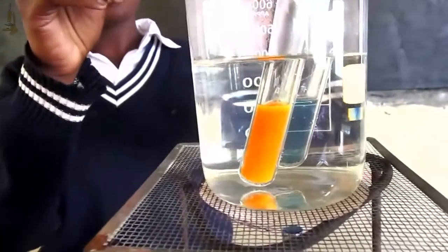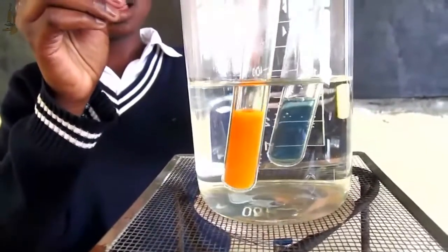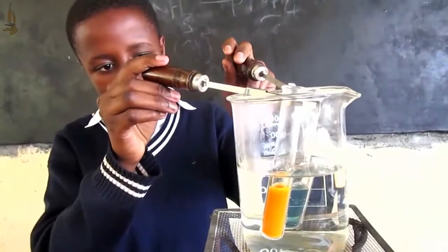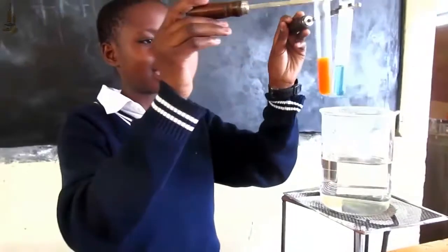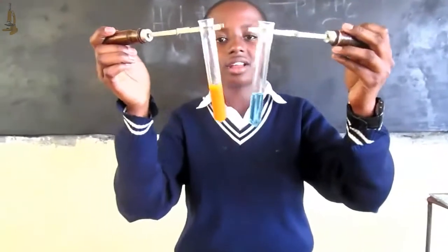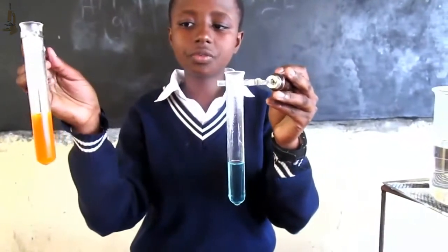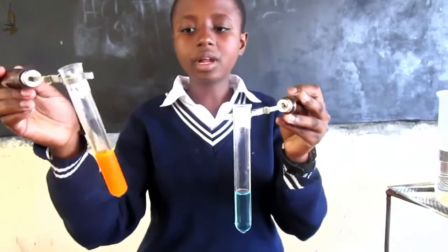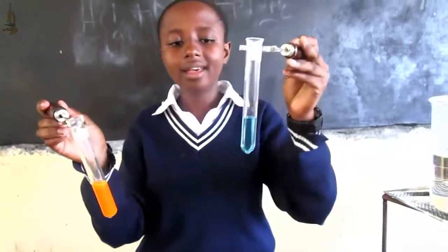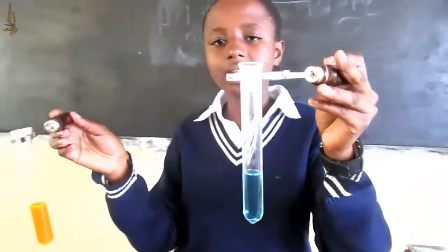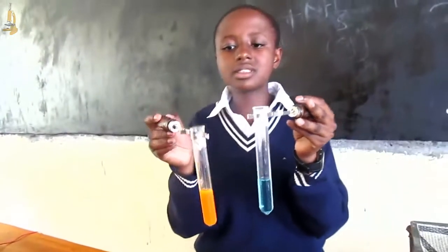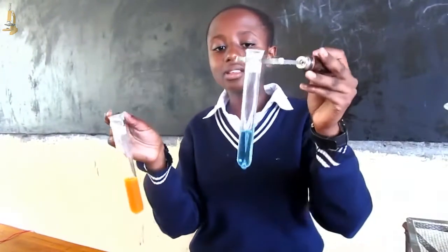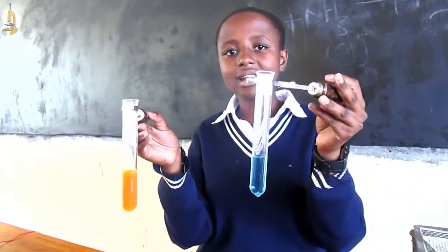As you can see, one of them has changed color while the other one has not changed its color. In our solutions, this one has changed from blue to green, from green to yellow, and from yellow to brick red or orange, while the other one has retained the color of Benedict solution. This means that this one contains non-reducing sugar while this one does not contain non-reducing sugar.